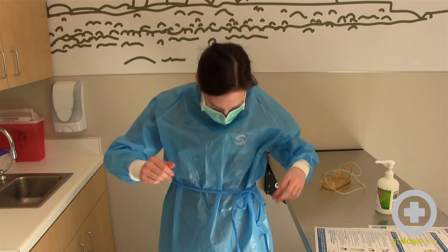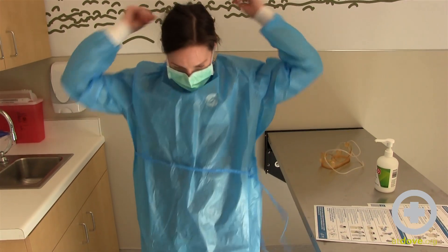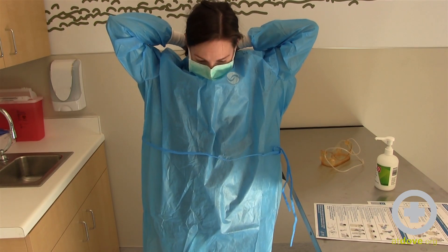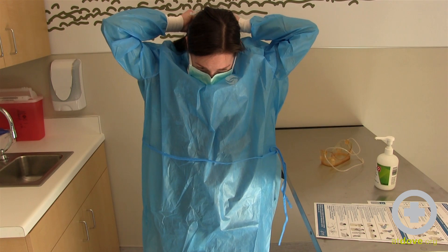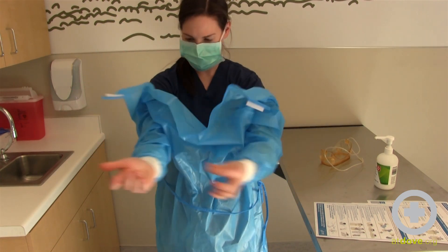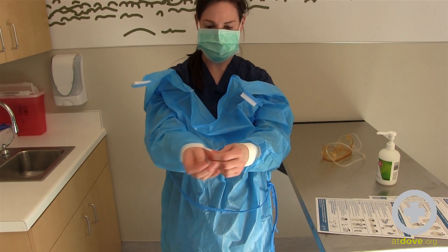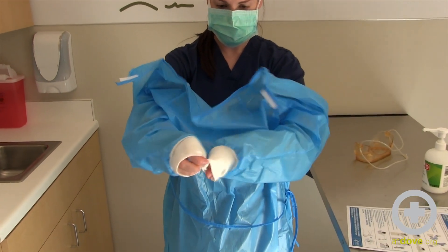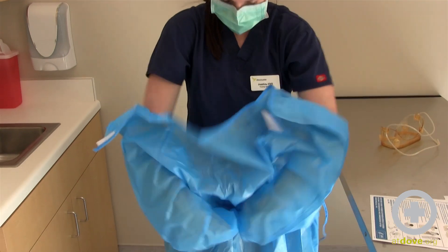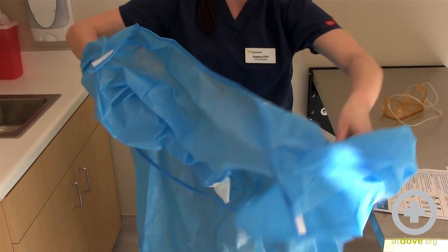Next will be our gown. I'm going to very carefully pull the end of my string and undo my Velcro since this is clean in the back. Carefully slide this down. You can pull on your cuff because that was inside your dirty glove. Work this down — turning it inside out is easier so you're not accidentally touching the contaminated outside layer.